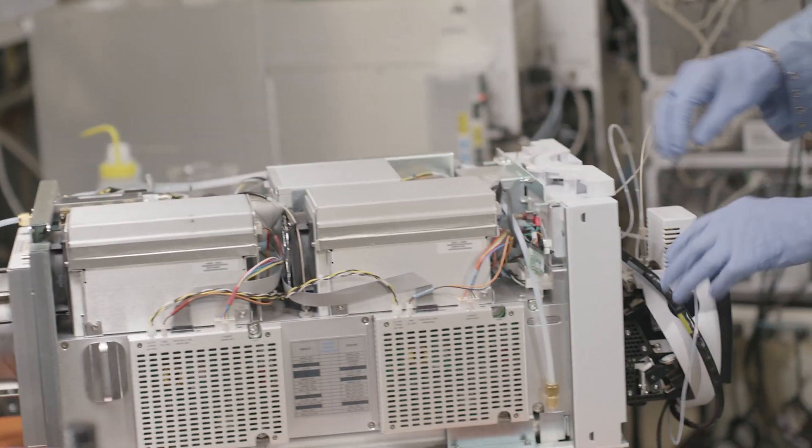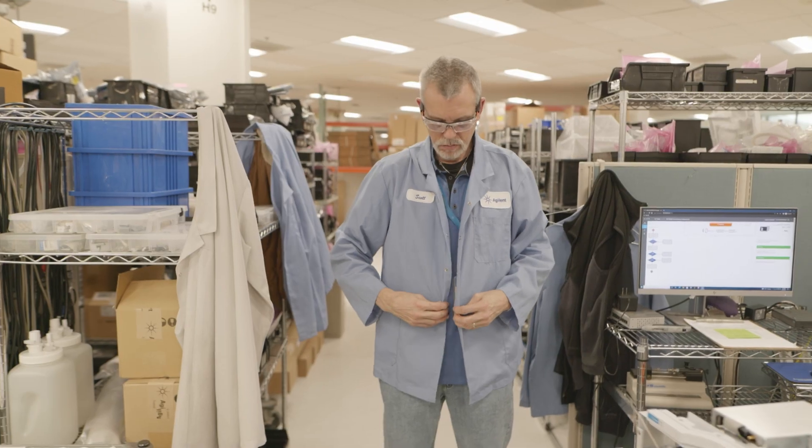Getting ready to PM this Altivo. It has passed all its preliminary tests upon coming in. Now it's time to give it a little TLC and a little cleanup.